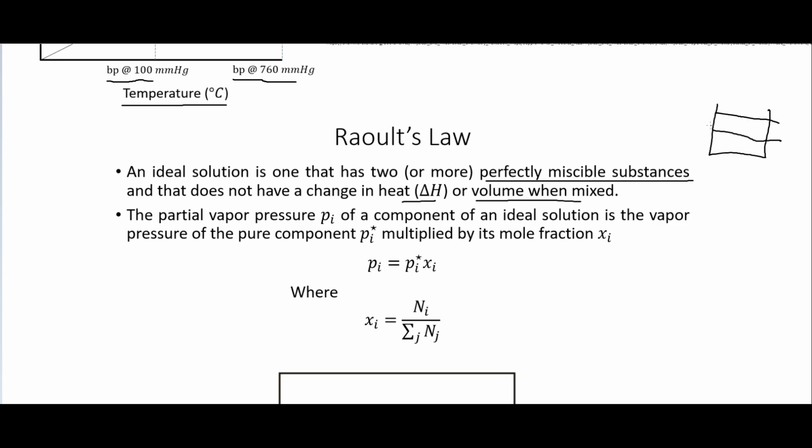So say we have these separated. These things are very miscible, so they wouldn't actually separate, but we can just think about this as a thought experiment. And so we have some volume here that is the two of them separated. And then when we mix them together, we will get something that looks like this that has a volume 2, and so we'll call this volume 1, where volume 2 is less than volume 1.